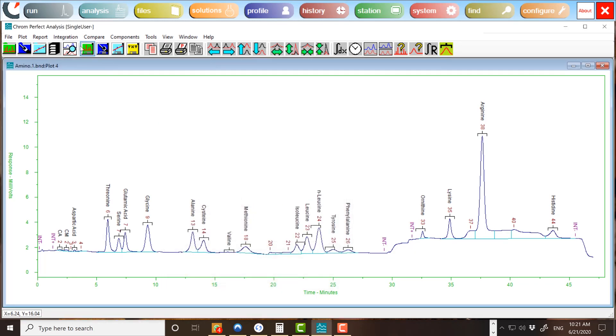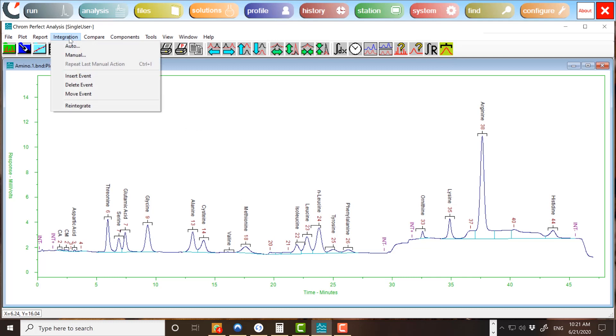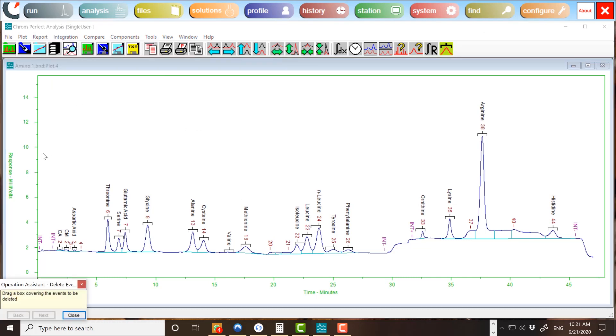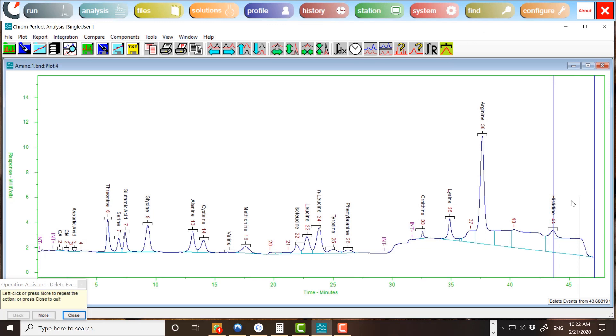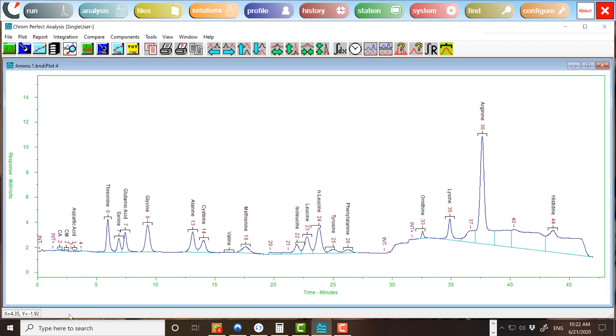To delete timed events, choose Integration, Delete Event. Simply select a region of the chromatogram with the mouse. Click, drag, and release to define the region, which will be indicated by a pair of vertical lines. To delete all events within the region, right-click on the chromatogram plot. The chromatogram will be reintegrated and the deleted event labels will disappear.